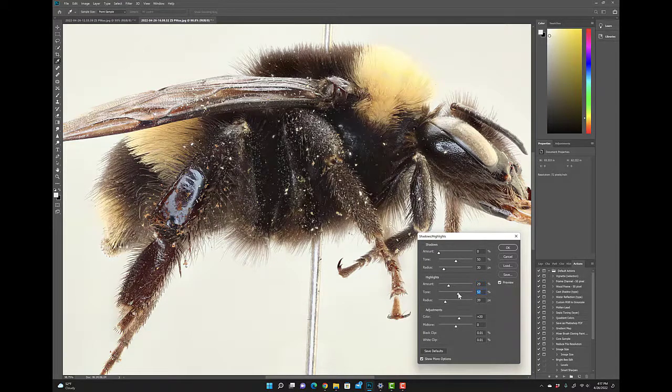Again, you want to make it so that it's a bit natural. This is a little closer to the border, but just to give you an example of where we are, let's do 30 and 60% and compare that to 0 real fast. You can see how much that glare was mitigated. Go back to 30. You can see how it's been dropped.